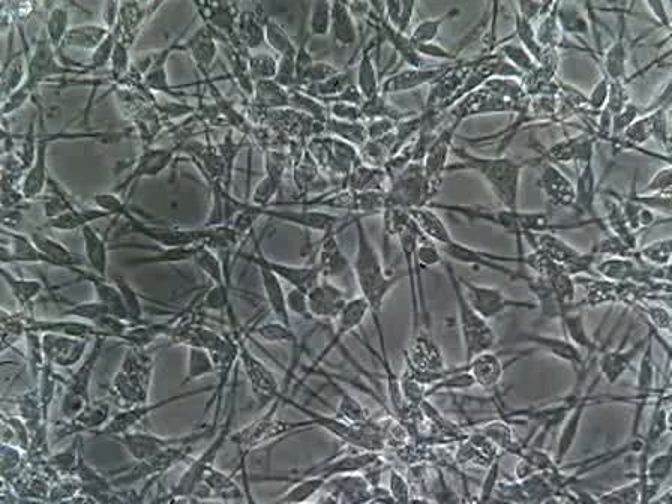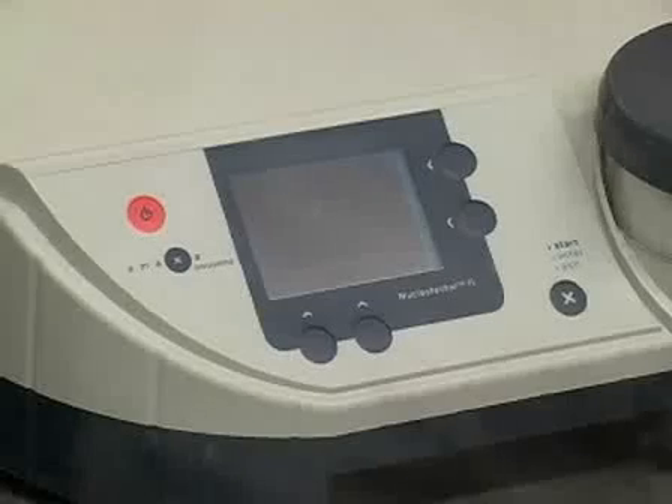Hi, I'm Steve. I work in Dr. Flanagan's lab at the Department of Pathology at UC Irvine. Today I'm going to show you how to transfect human neural precursor cells using AMAXA's nucleofector.